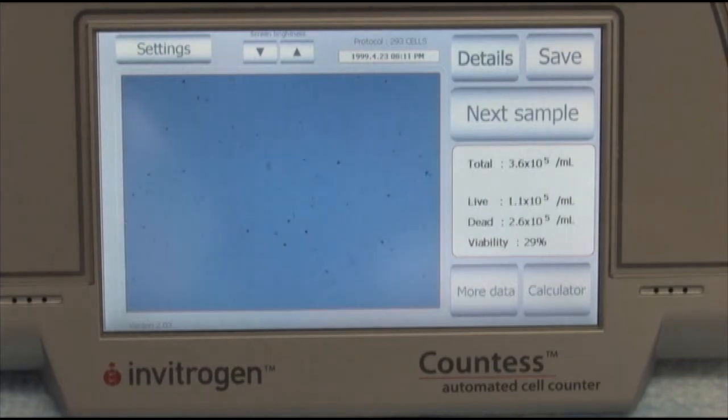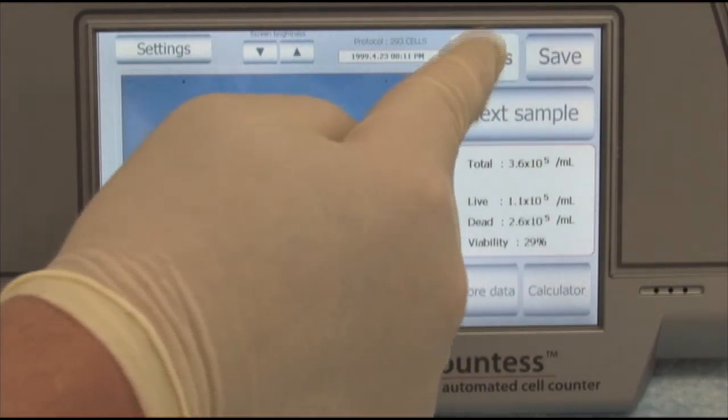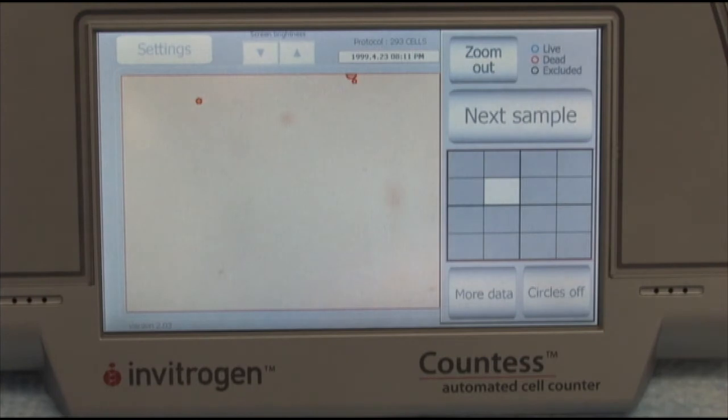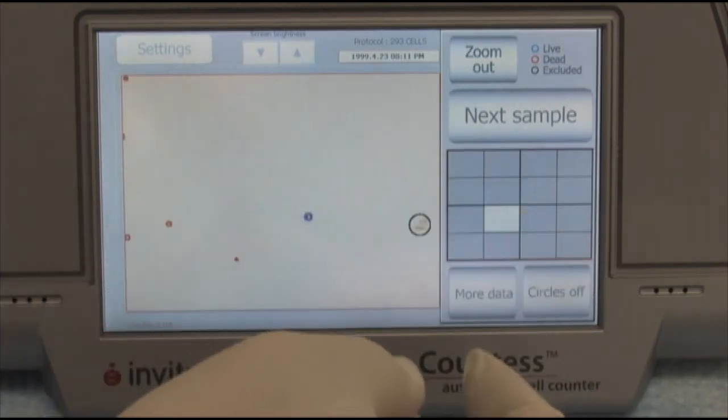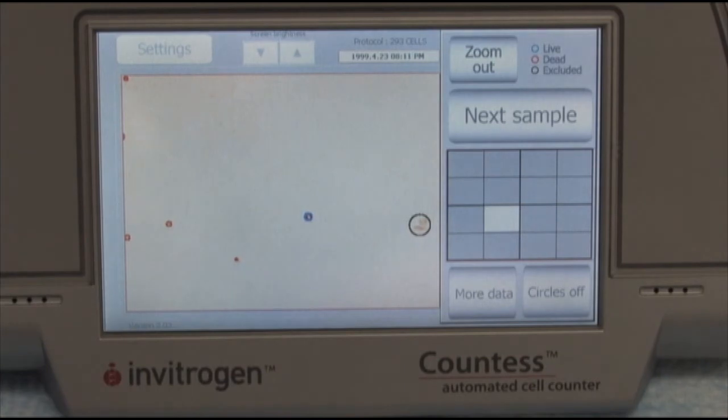After the cell counting is completed, I can hit details, can scroll around and find it's circling cells that are viable and that are dead.